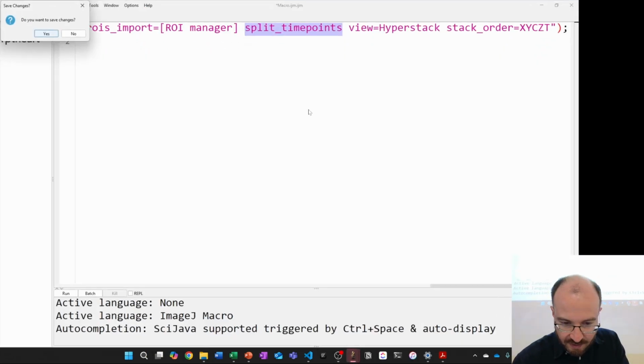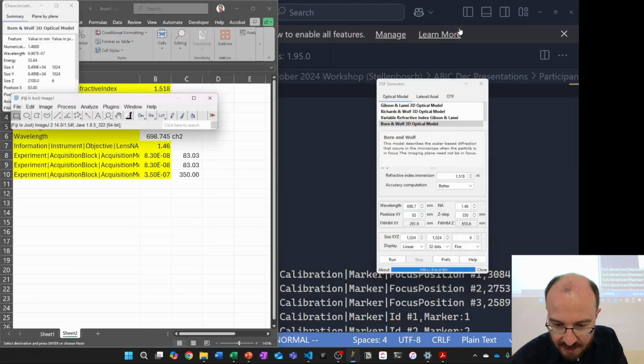All right, so just to start from a somewhat clean slate, I'm just going to close everything here. No.